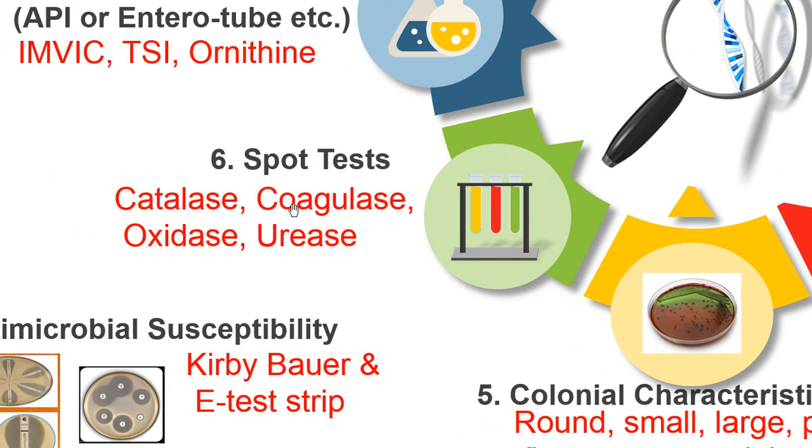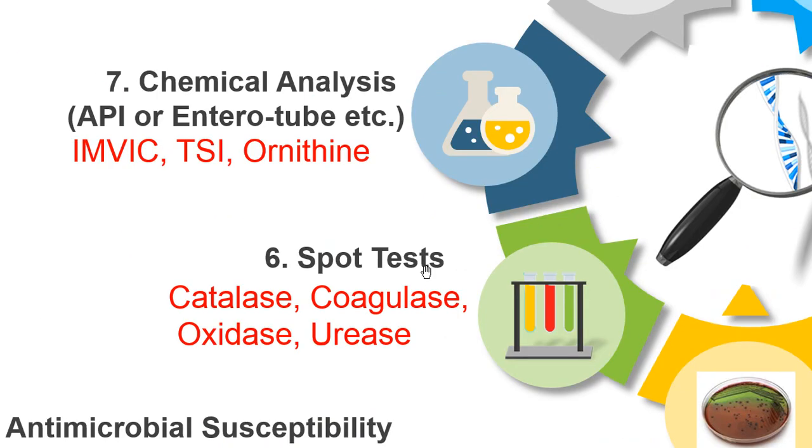The most common spot tests are for the production of catalase, coagulase and oxidase enzymes, because these are the enzymes that make microorganisms either pathogenic or non-pathogenic.